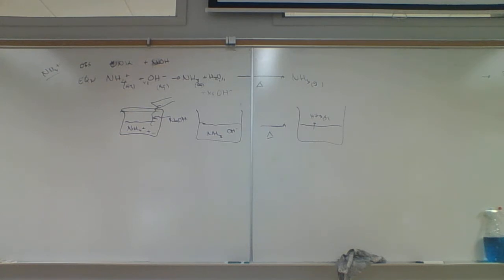And so if I exhale on this, CO2 is what? Acidic or basic? Acidic. So CO2 being an acidic gas should leave red litmus red. But if I had blue litmus, do you know what CO2 would do to blue litmus? It would turn it red. But we aren't testing for CO2. If I was testing for CO2, that would work.